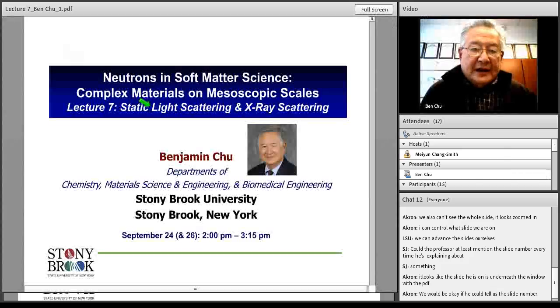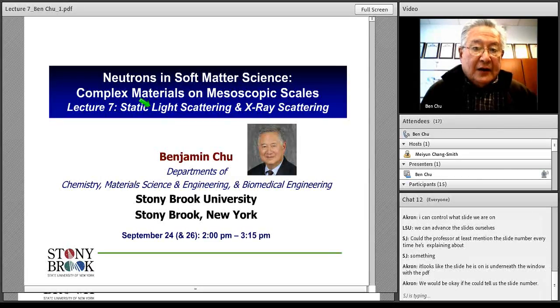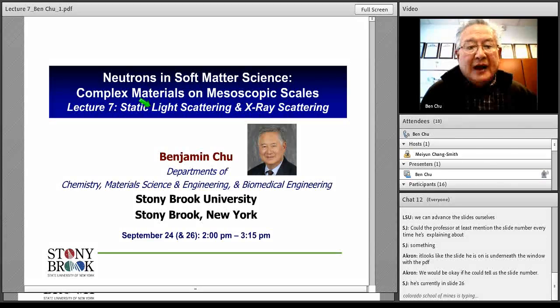Equation that one should pay some attention to. This fundamental equation is the simplest one. It's the starting point, and that is really to say that we are looking at, remember, R, capital R, with subscript A, comma, EX, meaning excess Rayleigh ratio, which is really implying that suppose we're looking at a solution, and later I'll repeat that again.